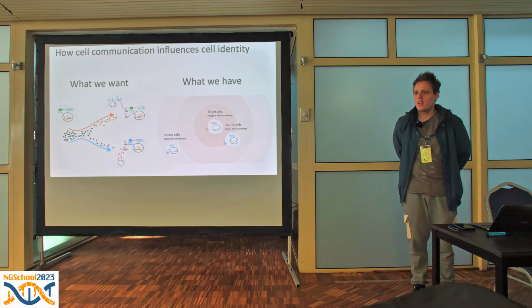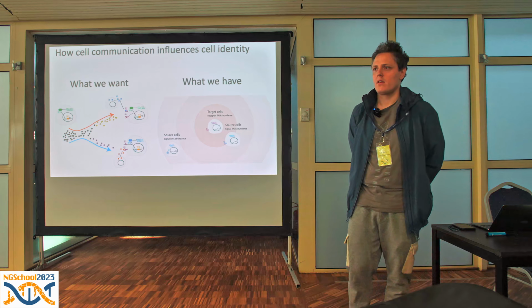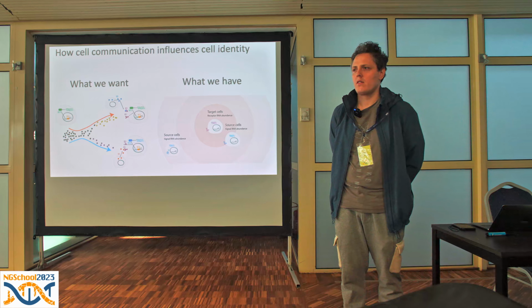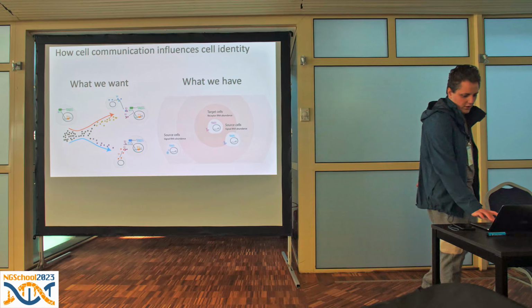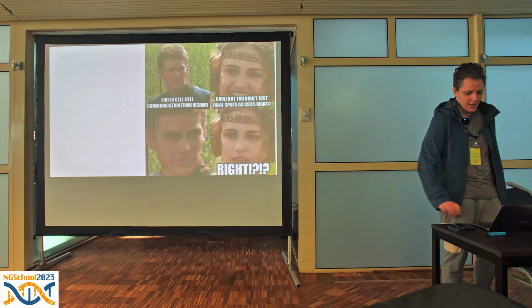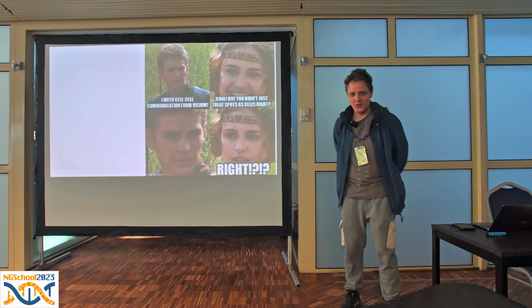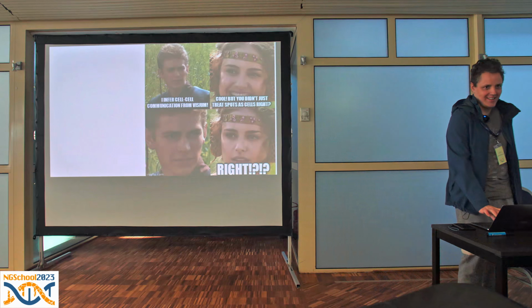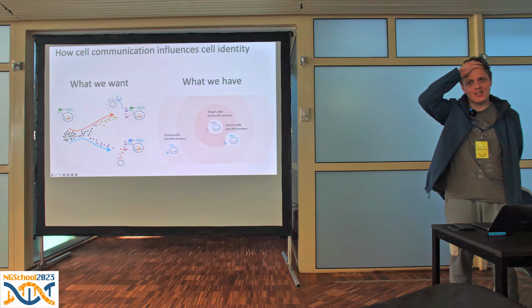I have a question. You mentioned that Visium is used for spatial transcriptomics. My question is, it operates on spots, so it's not single cell resolution. How is that resolved? Yeah, this is a very important point which we will discuss shortly when we come to the technology discussion. But yes, please all take note of that question. Don't treat spatial transcriptomics as cells. Any other questions about cell communication?